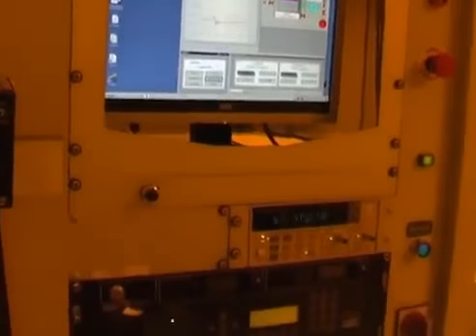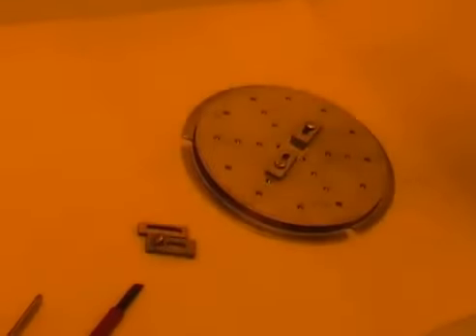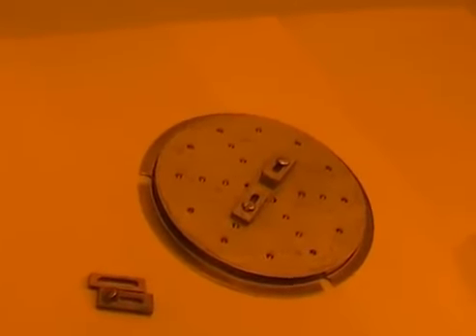And so now I'm actually ready to take off my sample, so I'm going to bring it back to the cabinet, and again it's a similar process to what I did before, but in reverse. So I take this one off, I can put this back in the drawer.